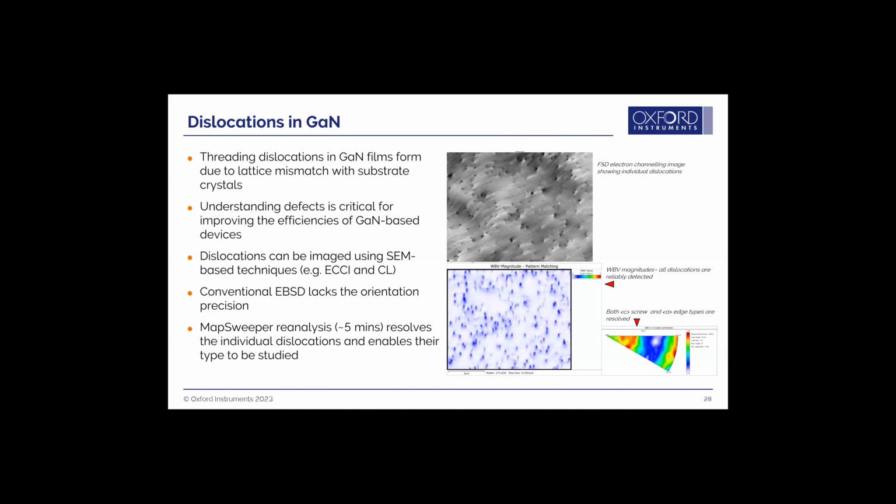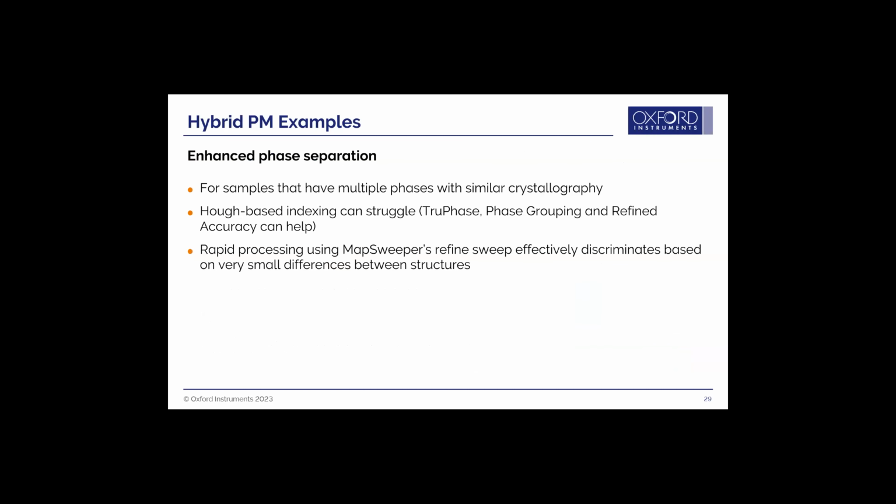And the dislocation analysis software actually allows us to reveal whether these Burgers vectors are into the plane of the image or out of the plane of the image, and which actual crystallographic direction they align with. So without that, you're kind of lost in the dislocation analysis without getting the better angular precision, sorry to say. Like I said, we're seeing detail below 0.01 on some of the refinement sweeps here.